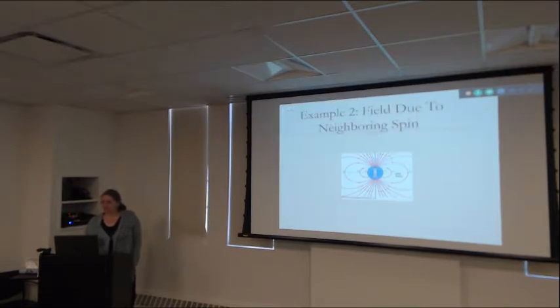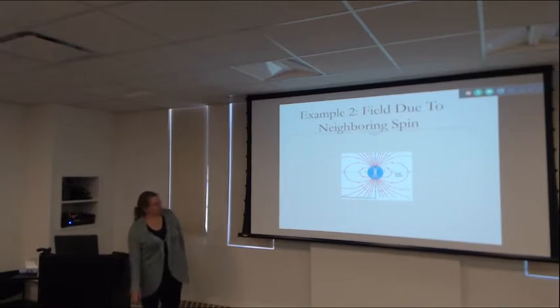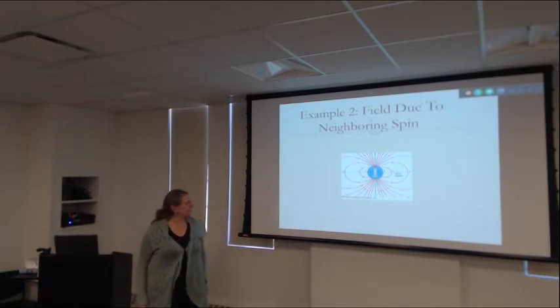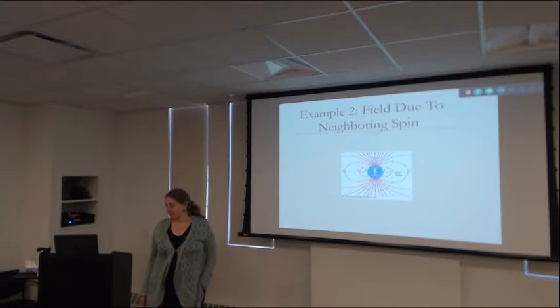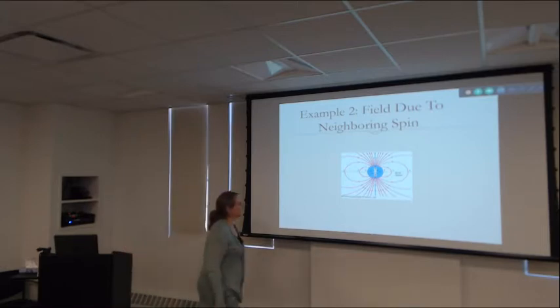For a lot of what we develop, I'm going to stay with the chemical shift. But before I do that, I just want to mention the other interaction we're going to be talking about, which is also anisotropic, is the coupling to a neighboring spin. And that neighboring spin casts a local field. This is through space. This has nothing to do with the bonding electrons in this case. The bonding electrons may affect it, but it would be a very, very small effect we never talk about.